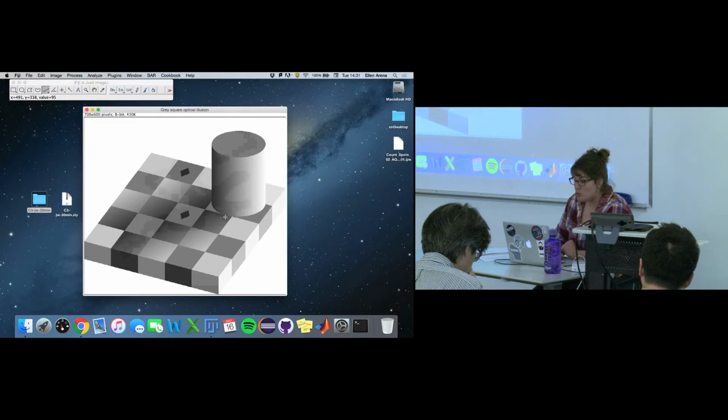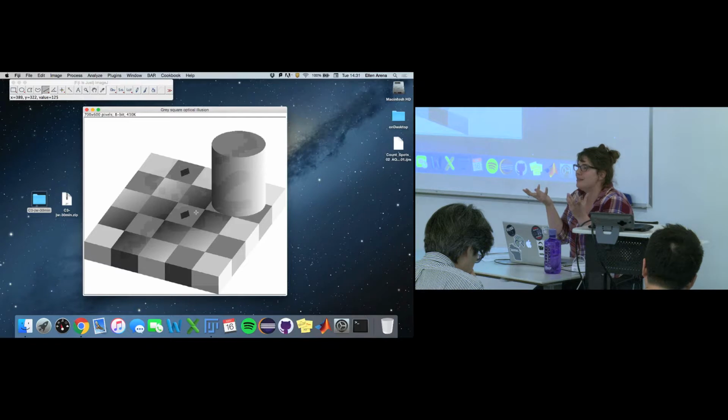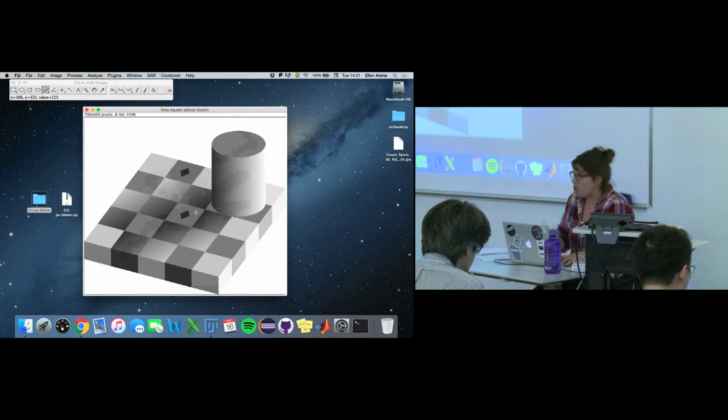But if you actually move your mouse over those pixel values, the value is 125 on this upper square, and it's also 125 on the bottom square. But because of that story our brain creates, we see two different gray values, right? And of course, these types of things exist in our biological data sets as well. So, when in doubt, measure, measure, measure, measure.